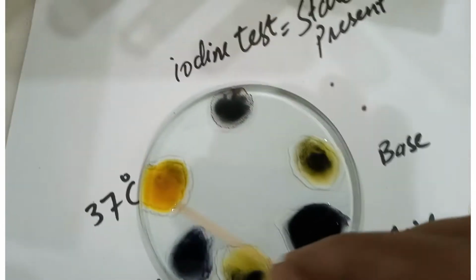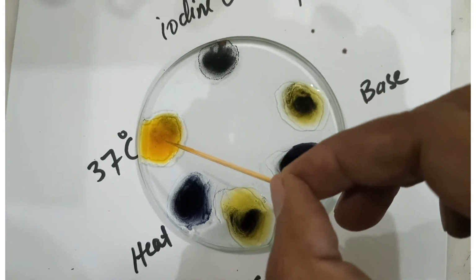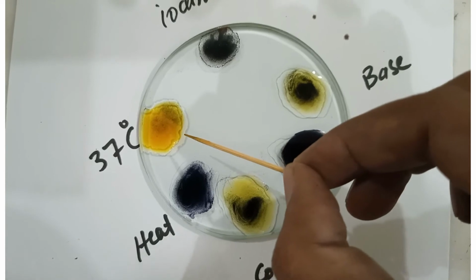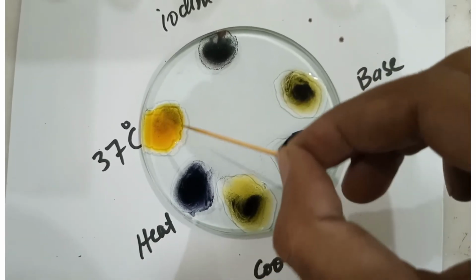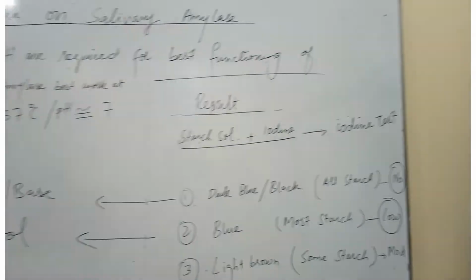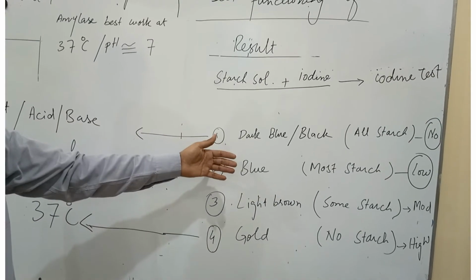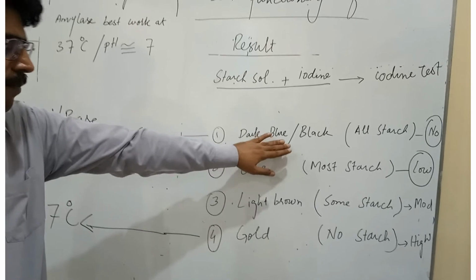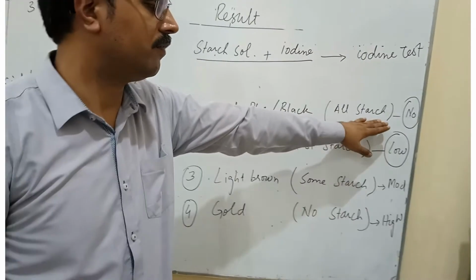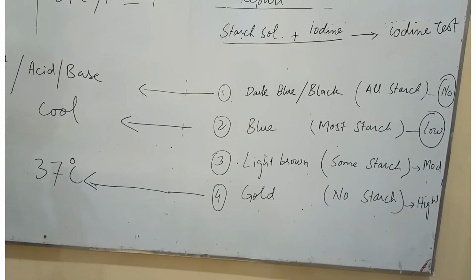The test tube that we put at 37 degrees centigrade has a golden color, and it means the amylase digested all the starch that was present in the solution. When we put an iodine drop, it gave us golden color. When we treated amylase with heat, acid or base, we added starch and then did the iodine test, it gave us dark blue or black color. That shows that all the starch was present in solution and there was no activity of amylase. Amylase could not perform its function.